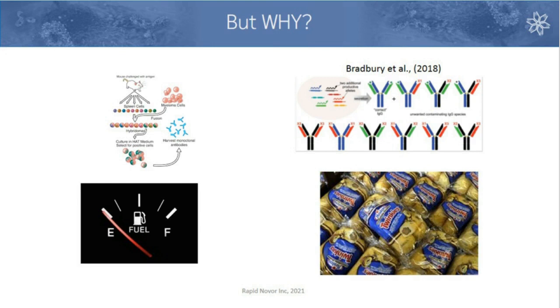These all can be contributing factors that could lead to a genetic drift in that original cell line, and thus a difference in terms of the expressed antibody that you're trying to work with. It might not even be you, it might be someone else that's selling you that antibody that's having that issue, but nonetheless, fundamentally, there's a problem with the antibody of interest that you've been working with. And that could yield a lot of issues, such that you only have that physical protein left to work with, and you might be on a limited supply.